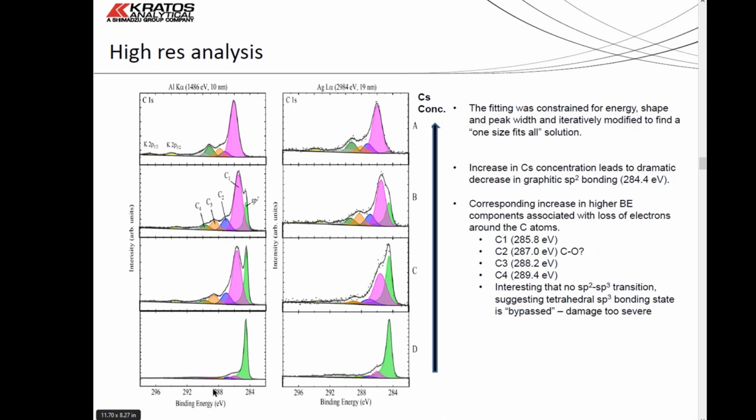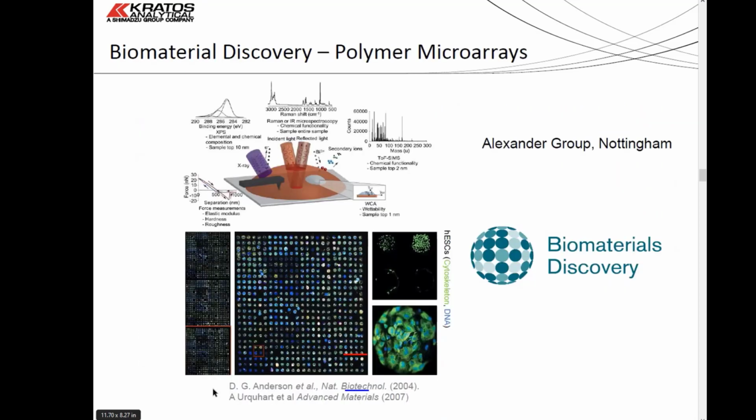But the interesting thing was correlating the change in the different carbon 1s peak shapes and seeing how that was affected by the bombardment of the cesium. That was one motivation for the project.